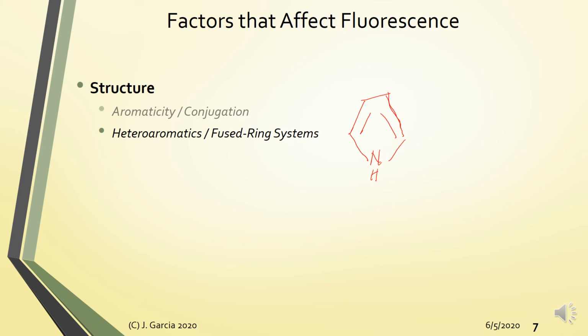But if you have a fused ring system, such as the case of indole, this molecule undergoes fluorescence. Okay? So this will fluoresce. Fluoresce.